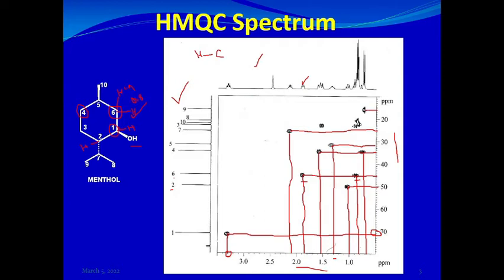The CH3 groups resonate at about 15–16 ppm on the carbon scale, and their protons resonate at around 0.7 ppm. This is how you read the HMQC spectrum. Let's now look at another example.